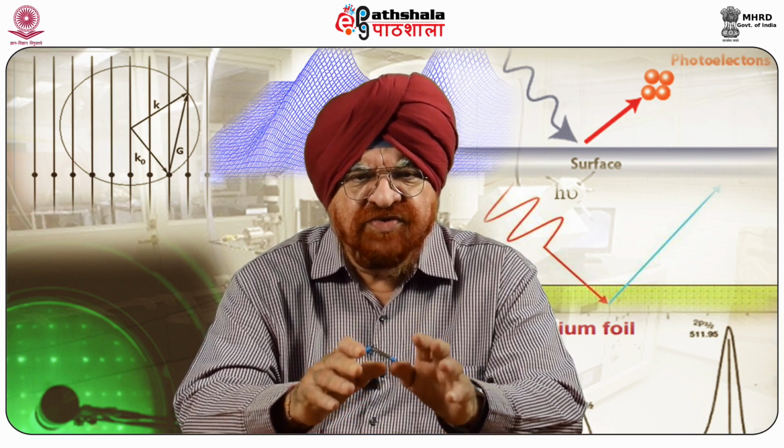Out of the above techniques, which I have enlisted, MFM has been extensively used in the past 2 decades for depiction of magnetic microstructures at the surface of ferromagnetic substances at micro or nanoscale. MFM can image concurrently the magnetic stray field of the surface and topography with a resolution of about a few tens of nanometers.